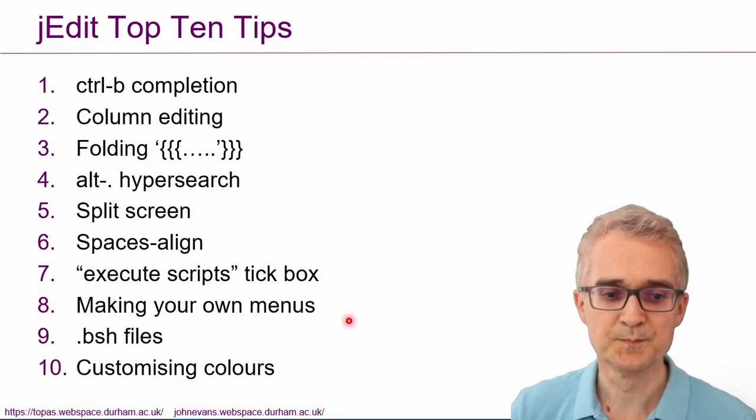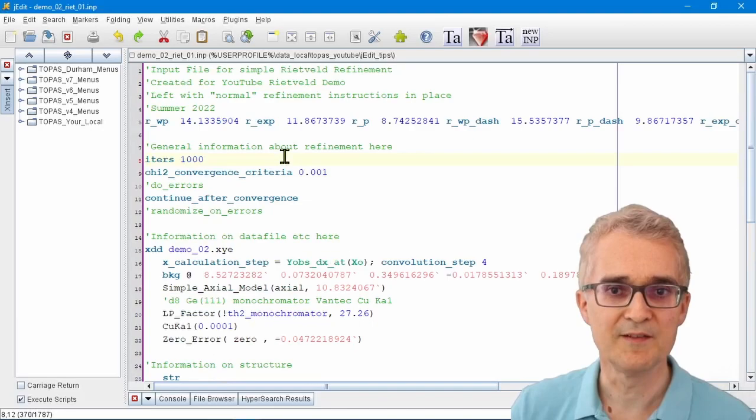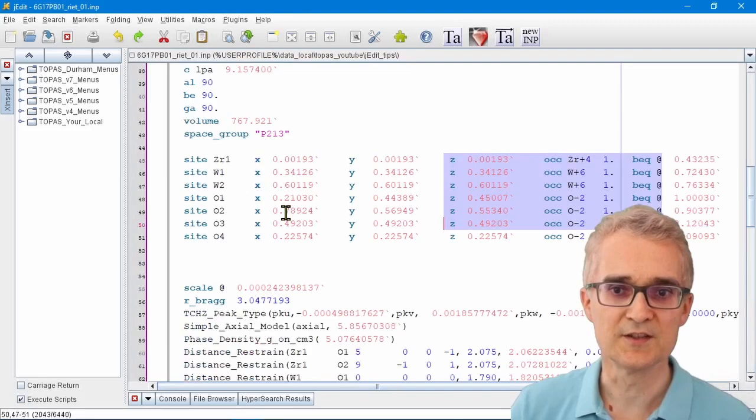Let's switch to my desktop. I've got a typical Rietveld refinement input file here. The first command that I find really useful is command completion.